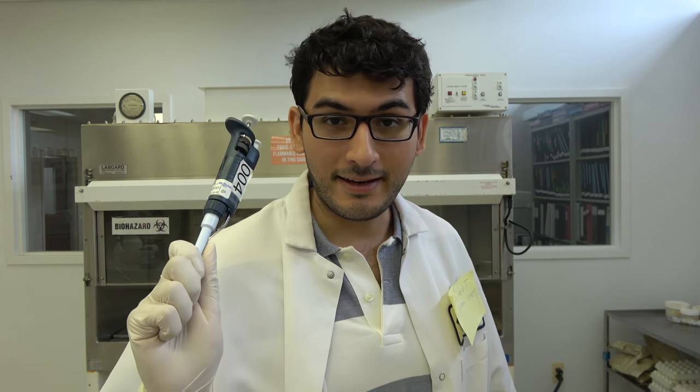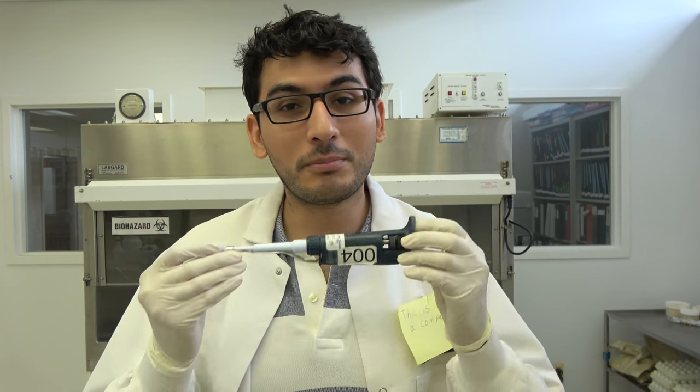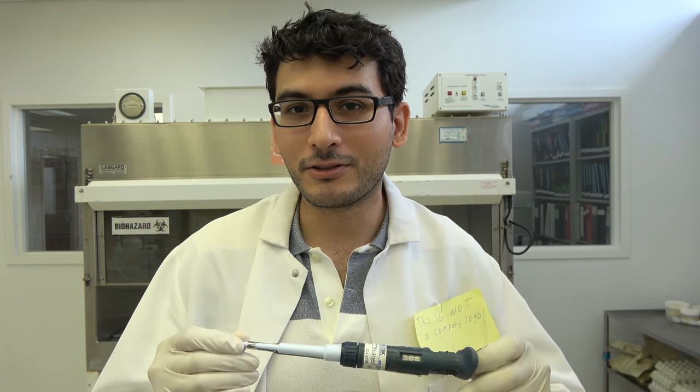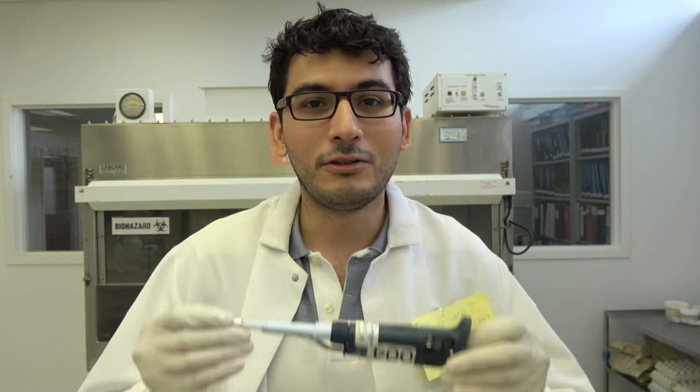Alright, here's one of the most important tools you will use in a lab. This. Not everyone calls this the same name, and it's really fucking infuriating. A lot of people call this a pipetter, pipet man, Gilson, pipettes. It's a micropipetter. Get it through your fucking head. It's a fucking micropipetter. Why is it called a micropipetter? Because it draws up liquid in microliters. That makes sense, you fucking imbeciles.